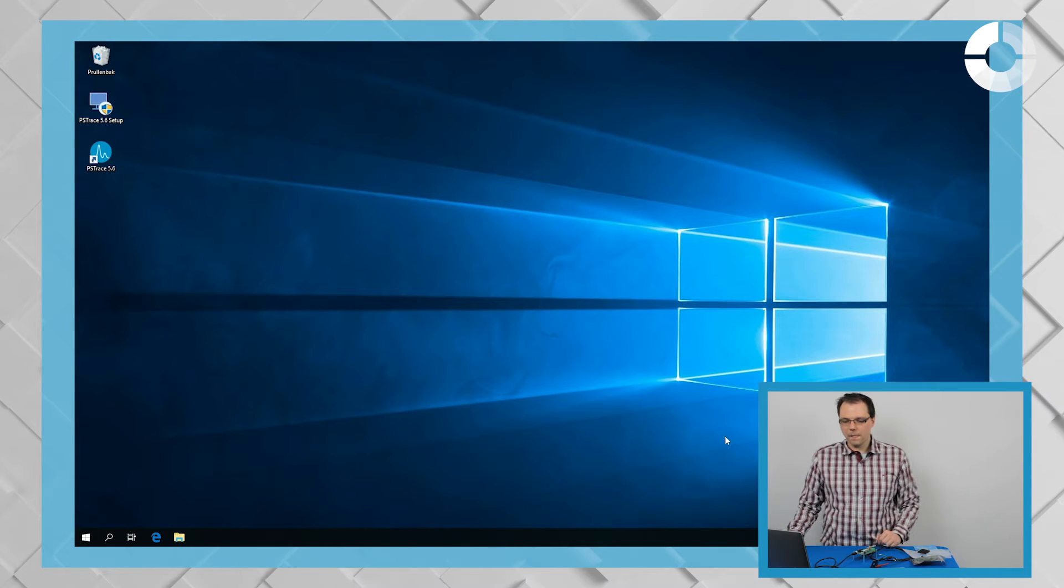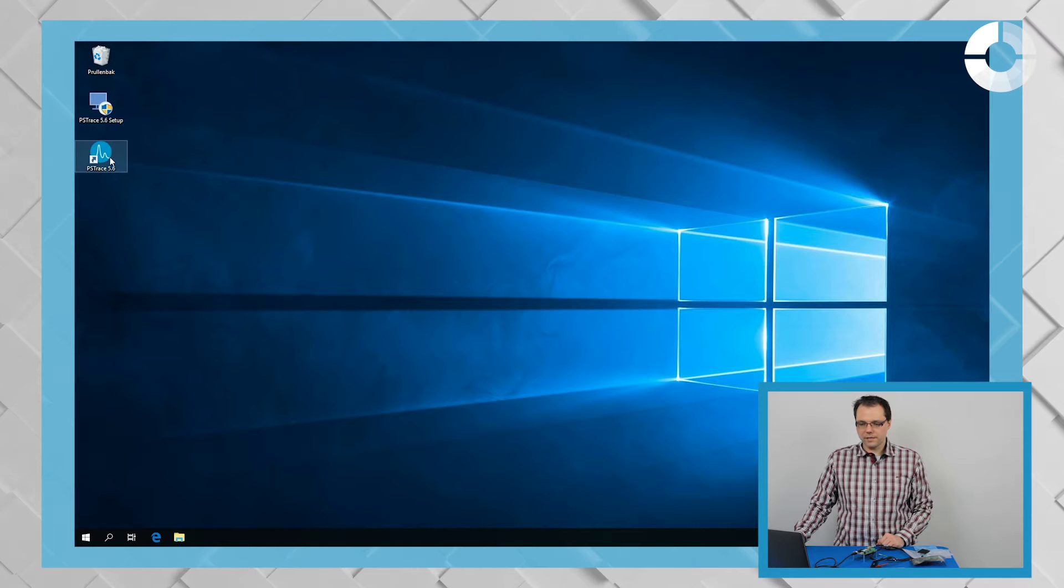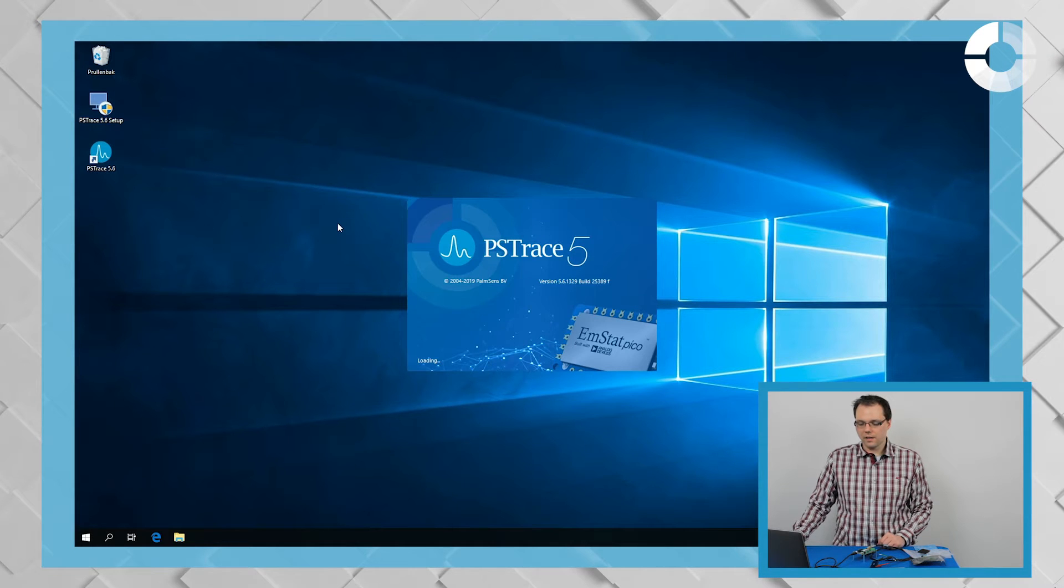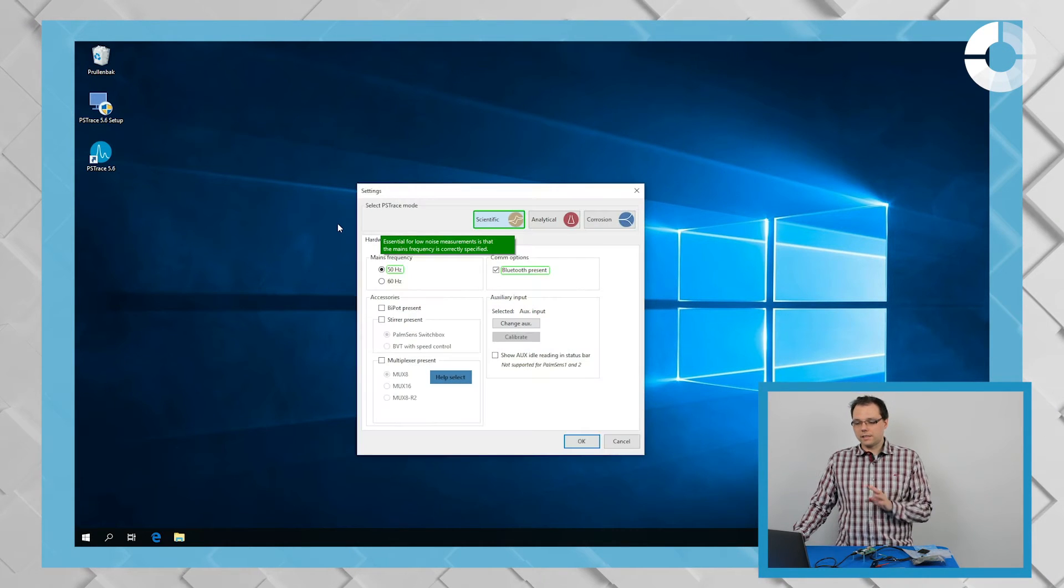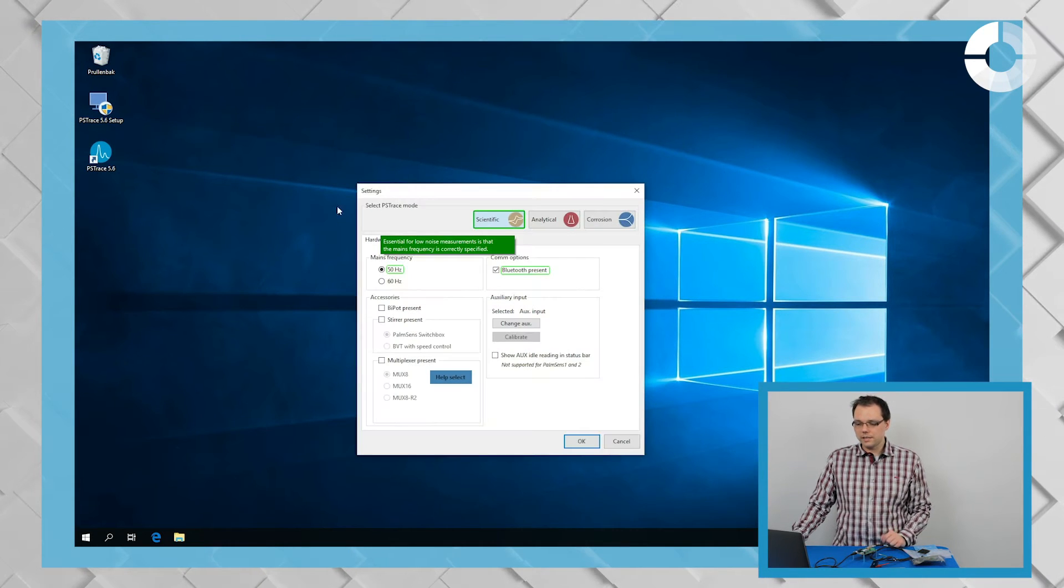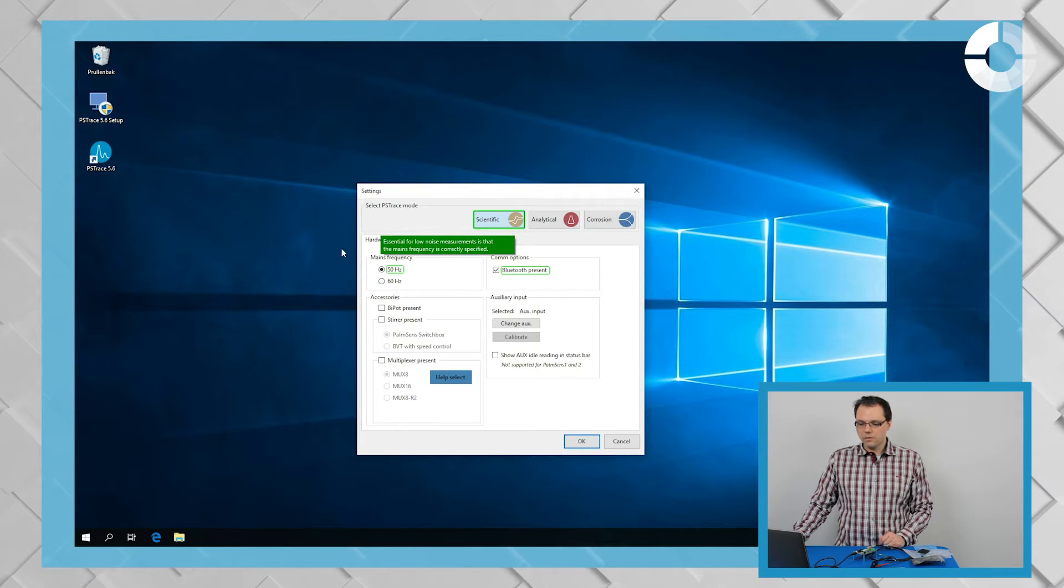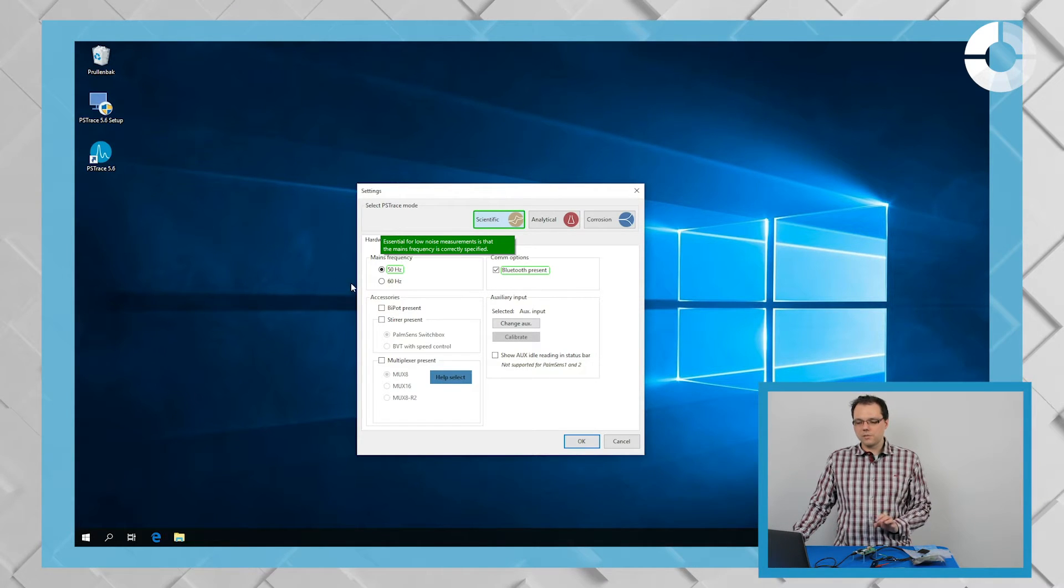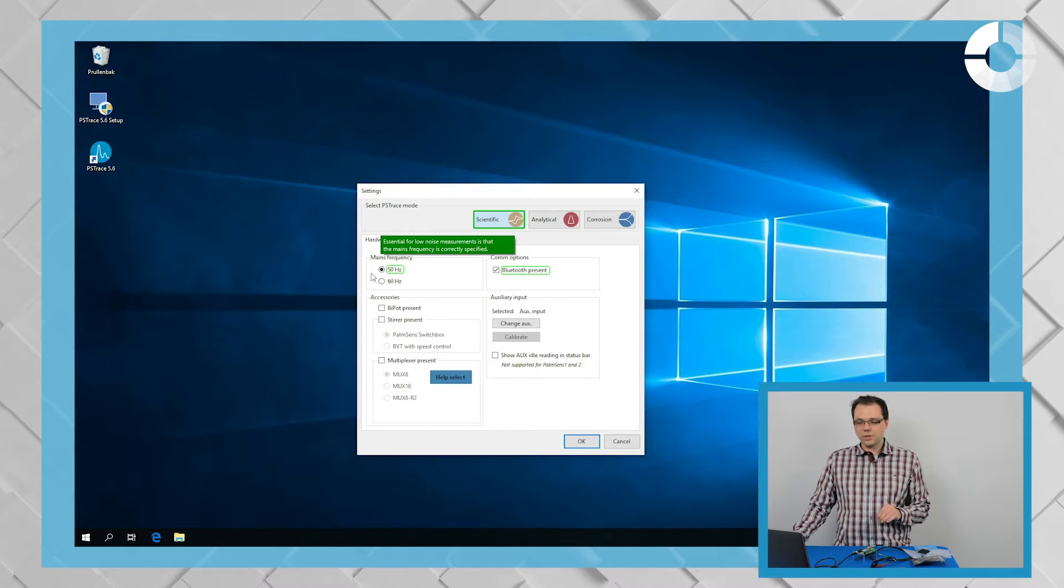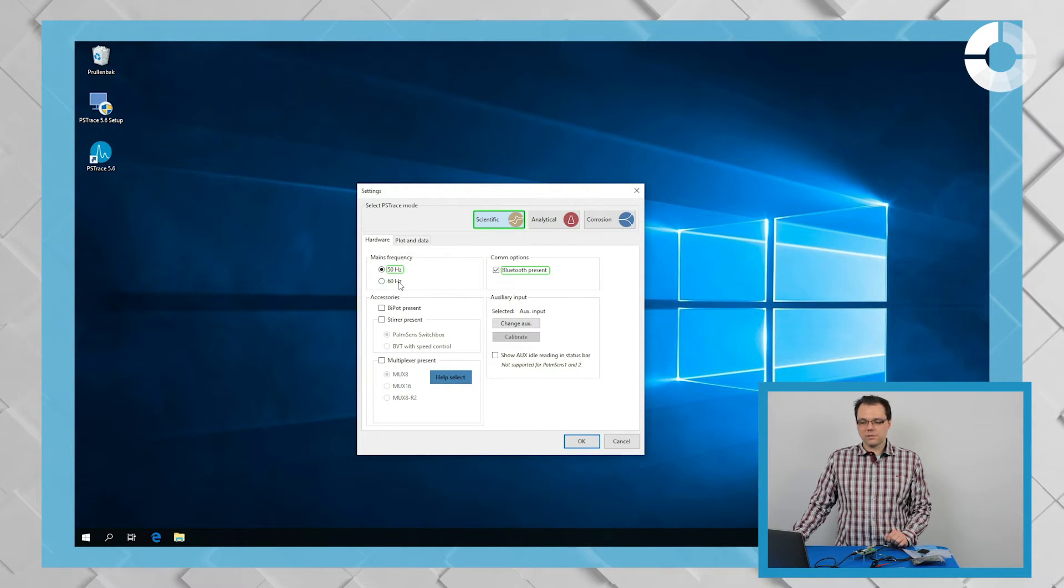Okay. When you start PS Trace for the first time, then you will get the setting screen. That's not so important for most of the time except you're in a country where 50 Hz is not the main frequency, then you should change the main frequency to 60 Hz in this setting.